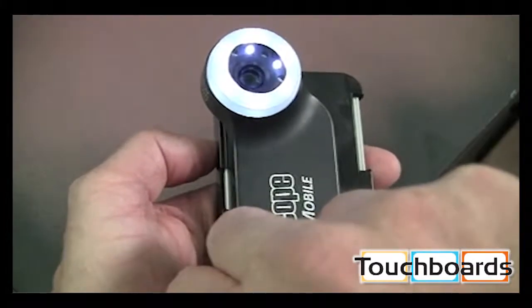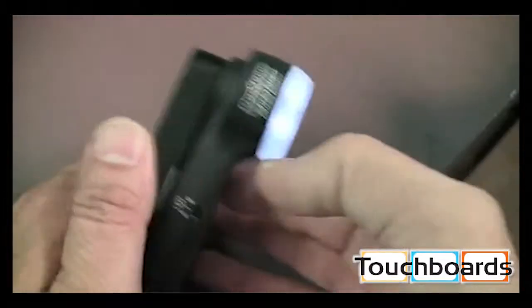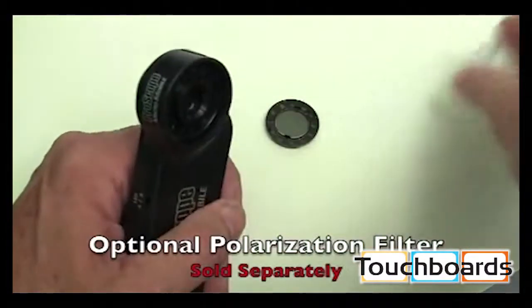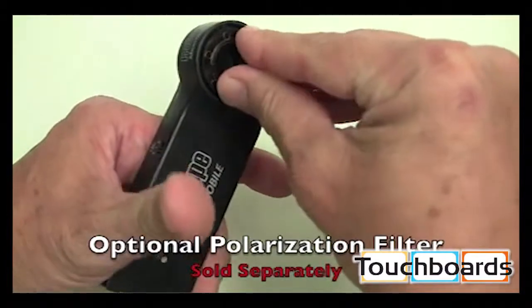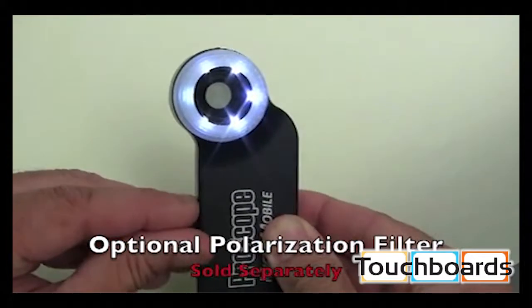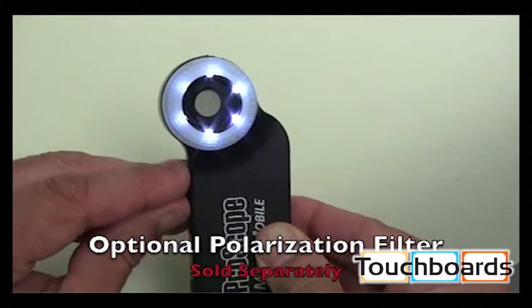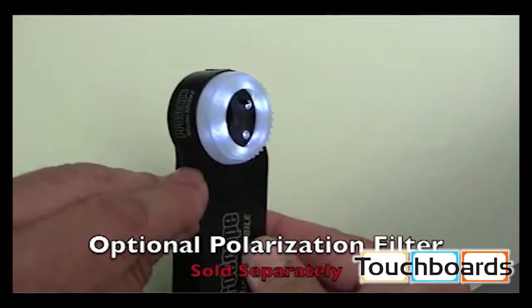The power button is also a rocker switch to ramp the LED intensity up or down. The A-B switch is used when you have the optional polarization filter mounted on the lens. The A position activates the LEDs under the polarization filter for a non-reflective view, while the B position activates the LEDs that are unfiltered for a reflective view.